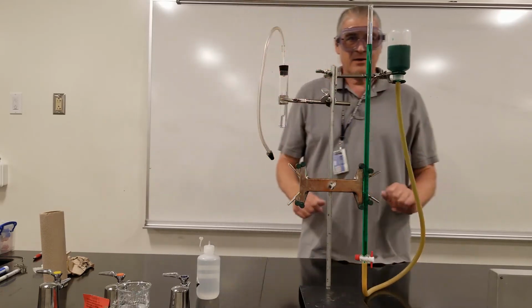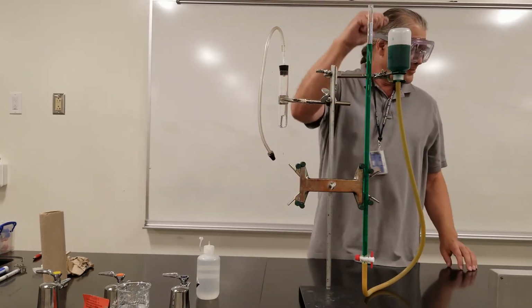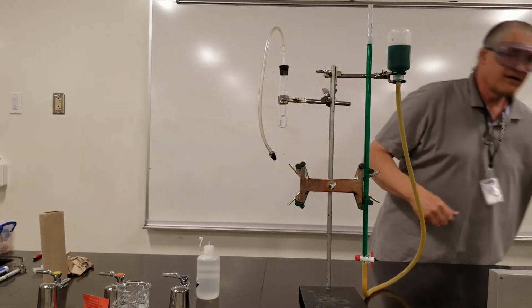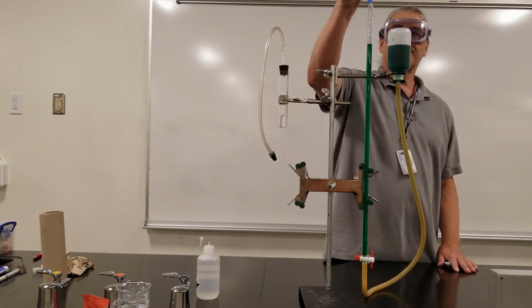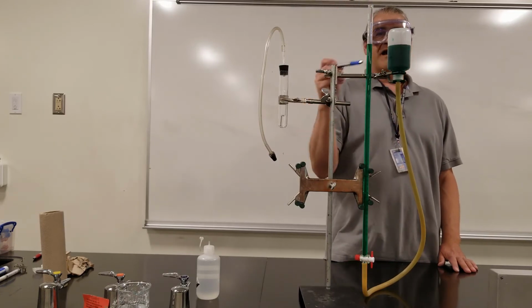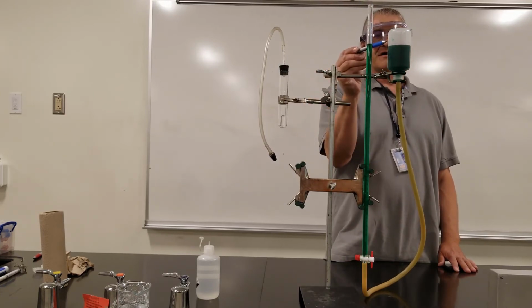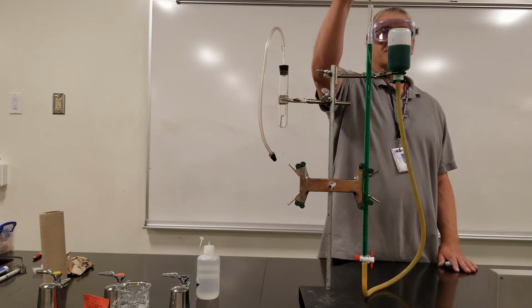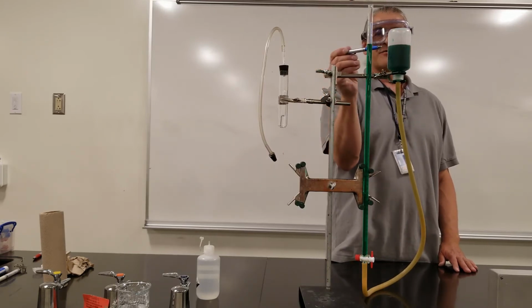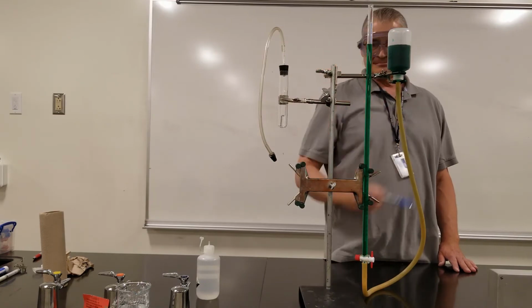Now, when both ends of the system are open, got a little hole here, so this is open to the atmosphere, this is open to the atmosphere. I have the same pressure here, here, and here. These two liquids are at the same level.